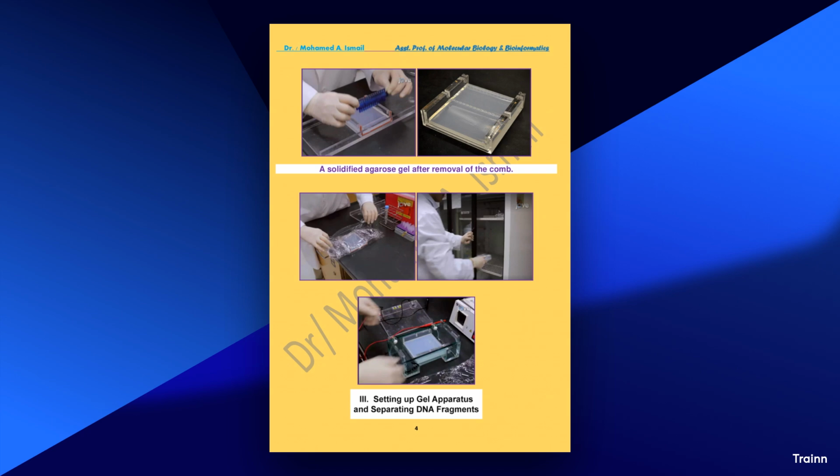Detailed overview of errors in agarose gel electrophoresis of PCR products. Agarose gel electrophoresis is a critical technique for analyzing PCR products, but errors can occur at various stages of the procedure. Understanding these potential pitfalls can help improve experimental outcomes and ensure reliable results. Below is a comprehensive breakdown of common errors and how to troubleshoot them.